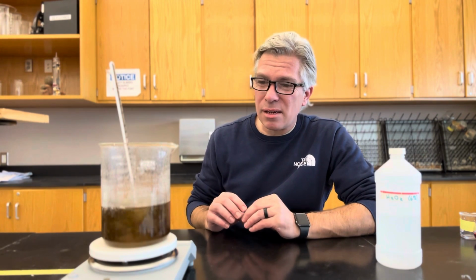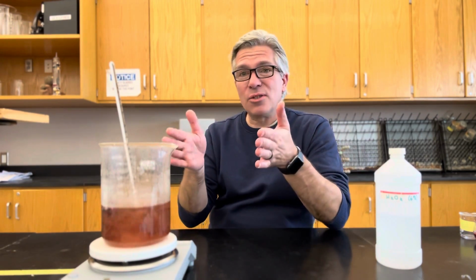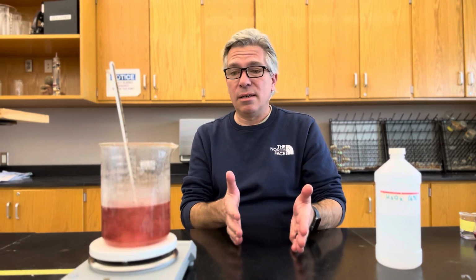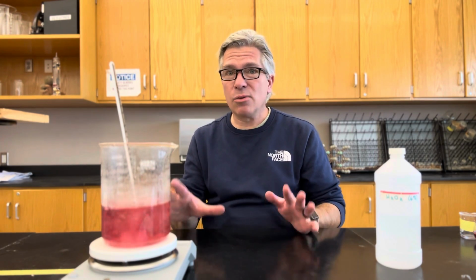The temperature has gone up a little bit during the course of the reaction. We're up around 74 right now. And check it out. So now we're back into the pink color that was originally from the cobalt ion. And in the middle, we had this green color. Okay, so what was that all about?